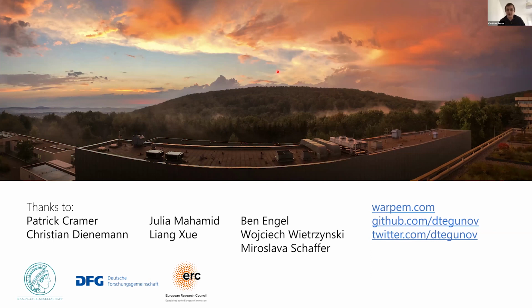Okay, and a further question. This is from Colin again. Does the noise-to-noise denoising in M use half sets of particles or odd and even movie frames like in Topaz? It uses just the usual half maps. This is basically what noise-to-noise needs: two independently noisy pieces of data showing the very same thing. And single particle analysis has had those two pieces of data since pretty much the very beginning.